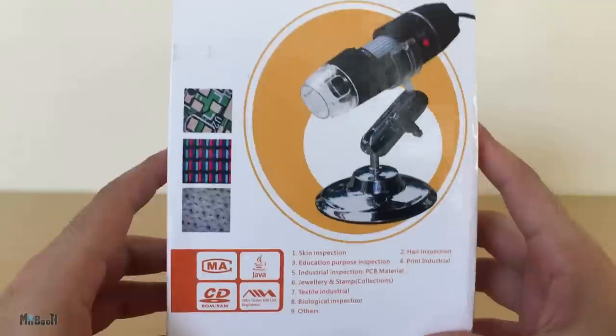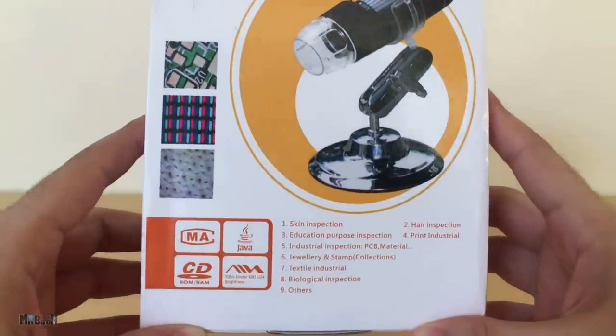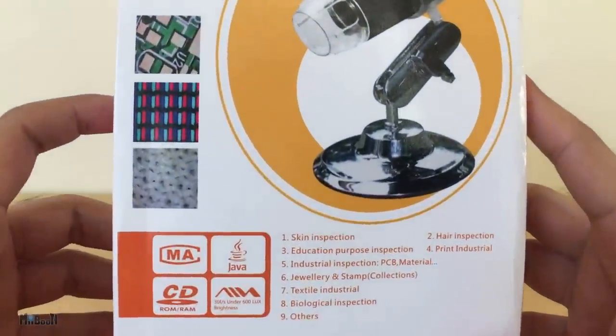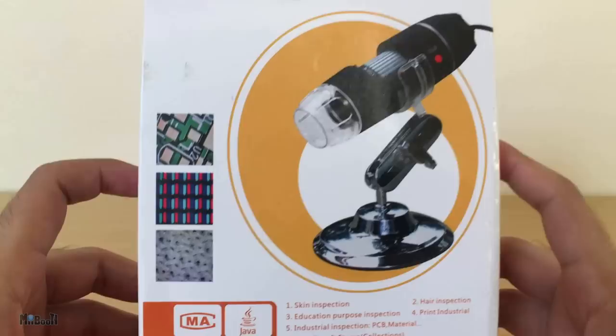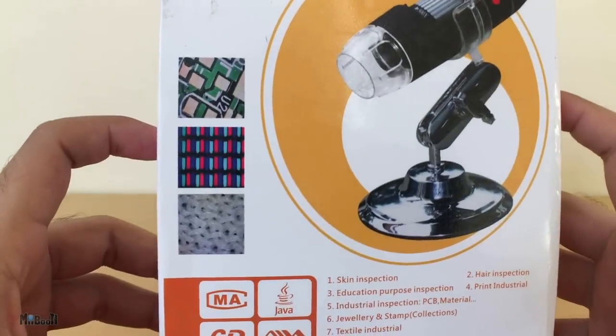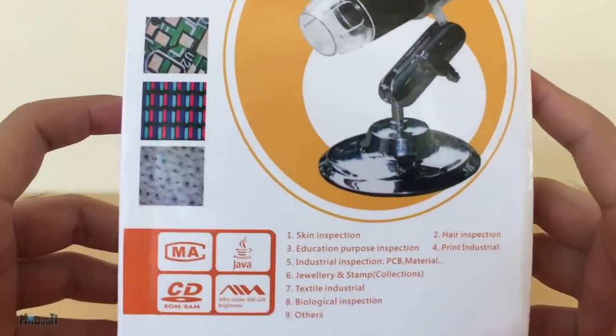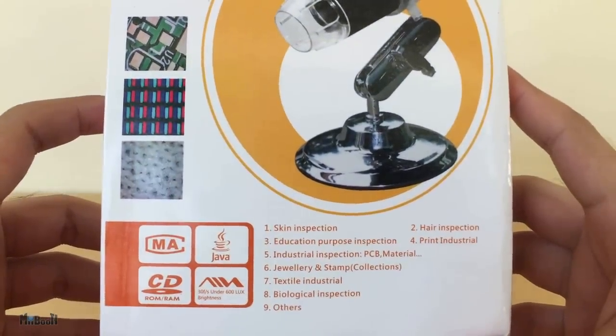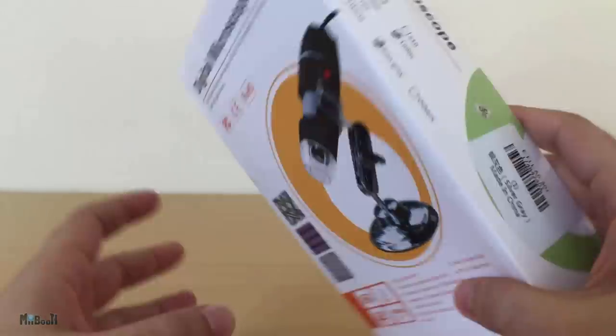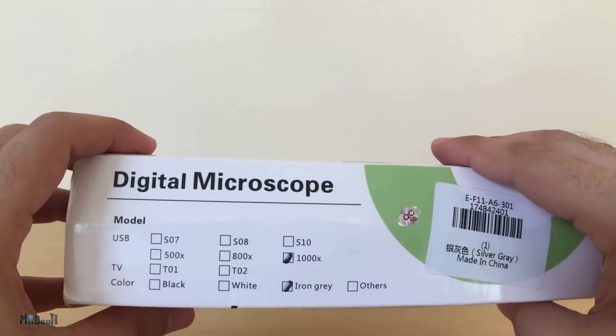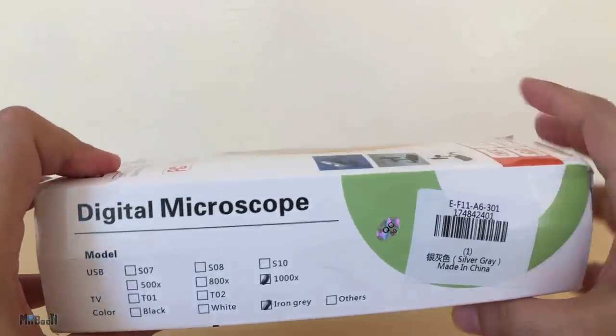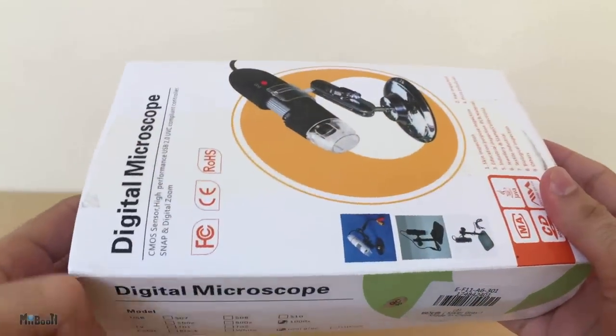Anyways, here's the box. It shows a picture of the main device, a couple sample pictures on the side, and some potential uses for it on the other side. It says a thousand X, the color iron gray. Nothing much, so let's dive in.